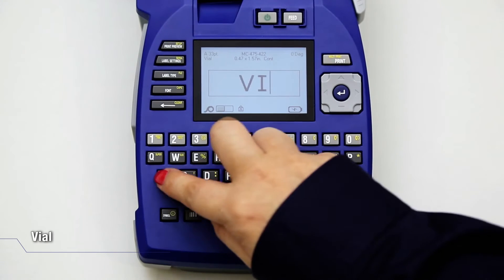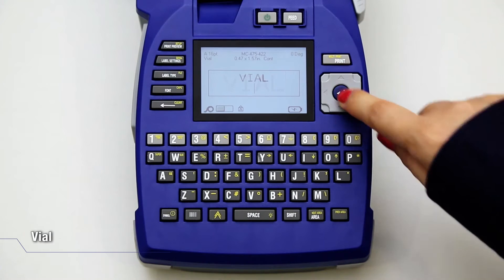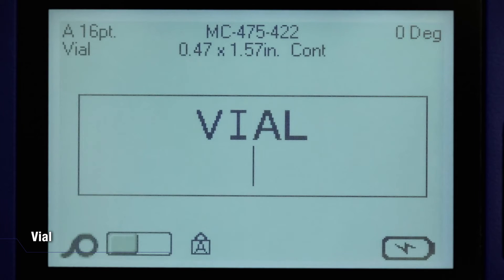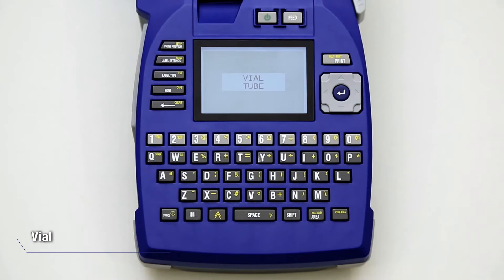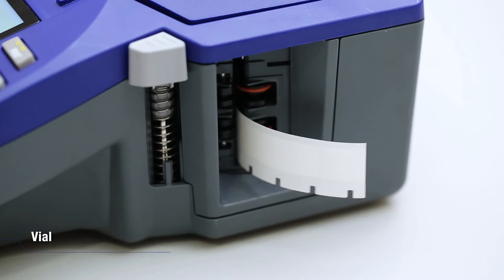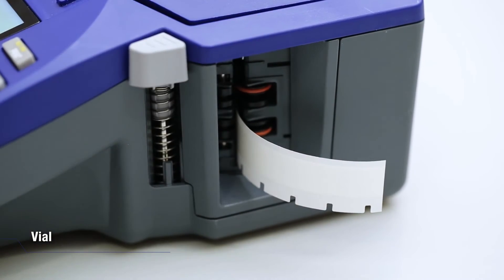Input text. Press Enter to input a second line of text. Press Print Preview to see how the label would look like. Then press Print if you are satisfied with it. Push down the cutter lever to cut the label and stick it onto the vial.